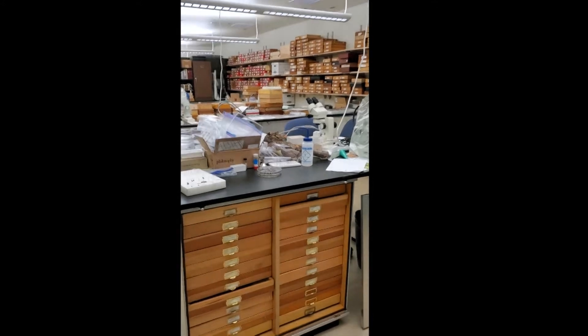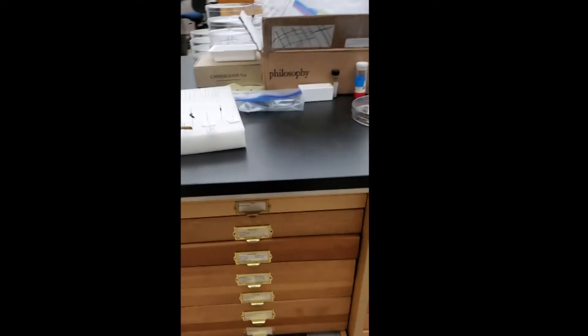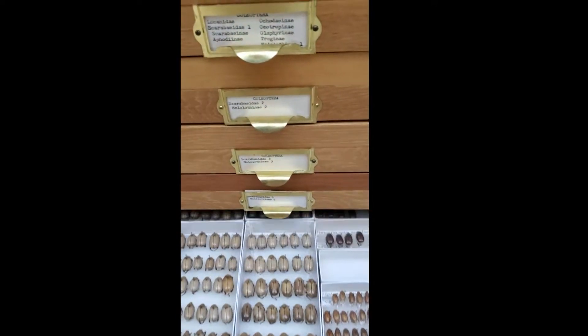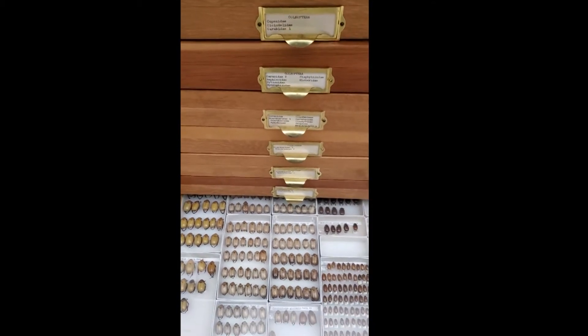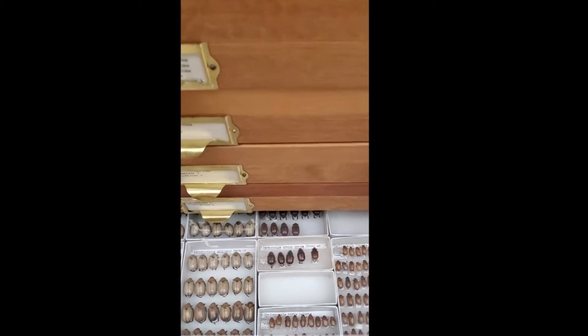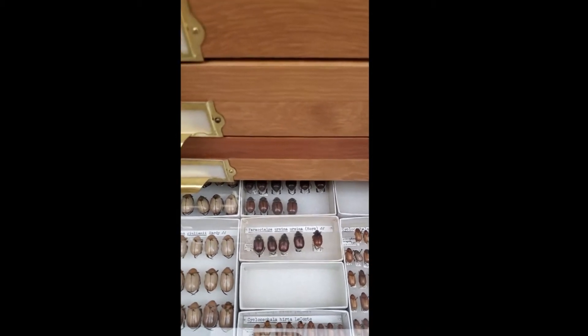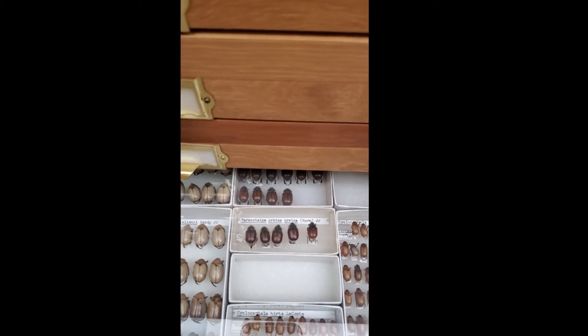When they are identified, they're moved to these drawers where they are segregated by species and in some cases by sex. If you take a look, you can see that each specimen is labeled with the scientific name.